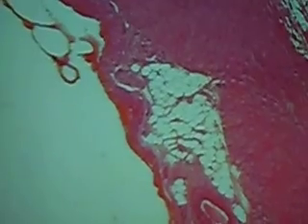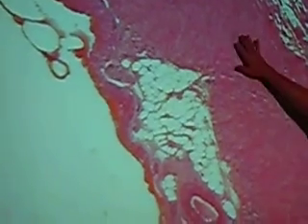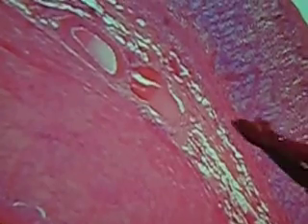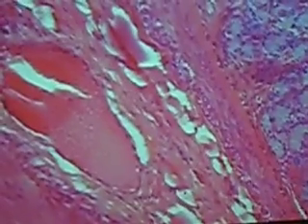Okay, the next one is the stomach. Yeah, remember I said there are like 3 pieces on the same slide. Go to the middle one. It's a little better. And the outside layer, oh, there's a little bit of outside layer. It's called serosa. What's the 3rd layer? Muscularis. Good. What's the 2nd layer? Submucosa. And then what's this large layer? Mucosa. Good. And in the stomach mucosa, you guys have to be able to recognize 3 kinds of cells.